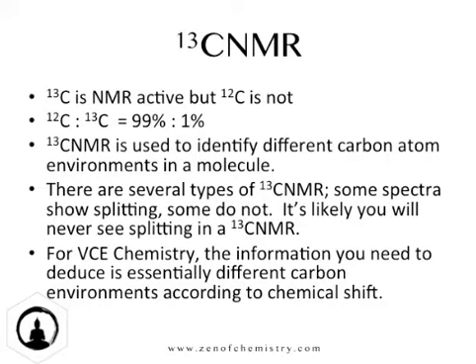So the peaks are relatively a lot smaller, and carbon NMR takes a lot longer than proton NMR. Carbon 13 NMR is essentially used to identify different carbon atom environments. Depending on the different type of carbon NMR you do, or depending on whether you've got splitting, all sorts of things, it's actually much more complicated than proton NMR in the grand scheme of things, but for the purposes of basic spectroscopy, we'll be talking about carbon environments.